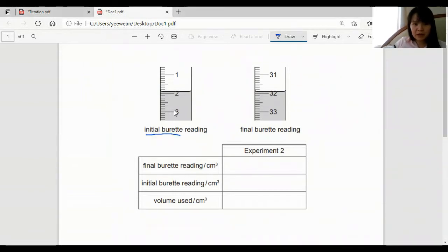So let's look at the initial burette reading. Zero is up here and each one of this is 0.1. So here is 1, this would be 1.1, 1.2 and all the way here.